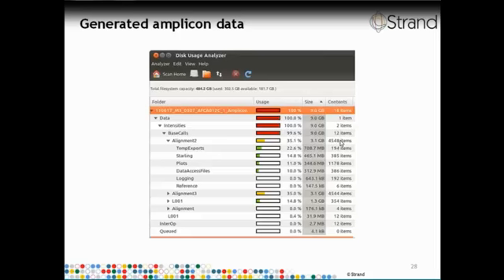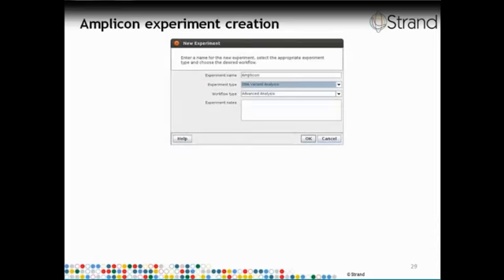So as we discussed, there are a large number of samples. You can see there are 96 samples, and we do have some replicates. And for each of the samples, we have an indel file and we have a SNP file. But what we'd really like to do is identify SNPs which are common across multiple samples. For that, we first need to create a multi-sample report. At present, we don't create one directly from the MiSeq data, but we will do that shortly.